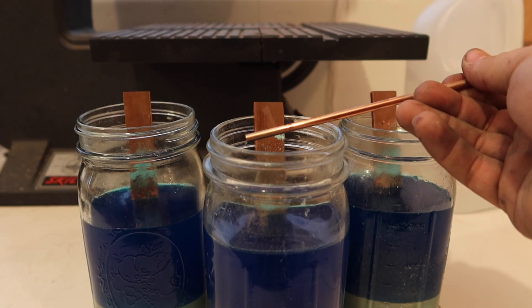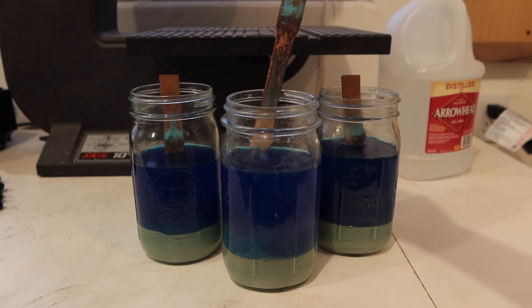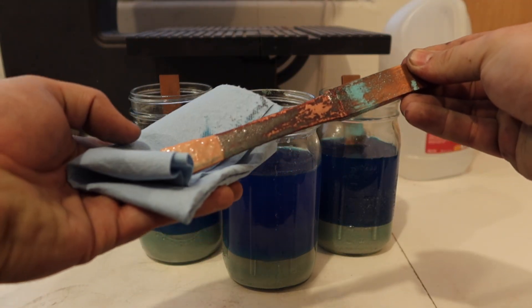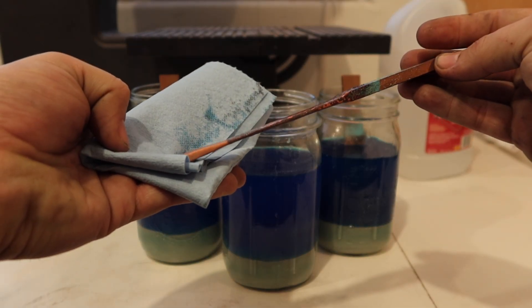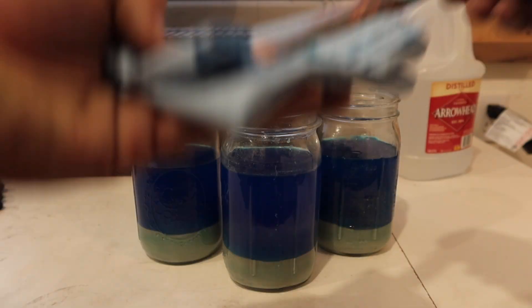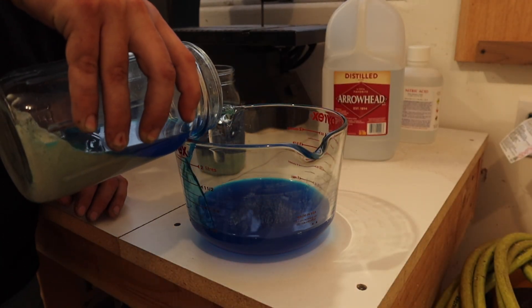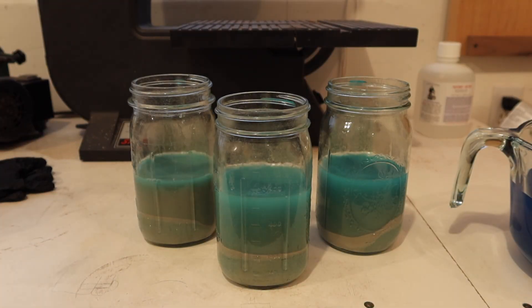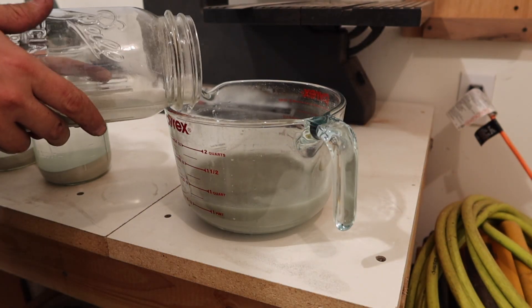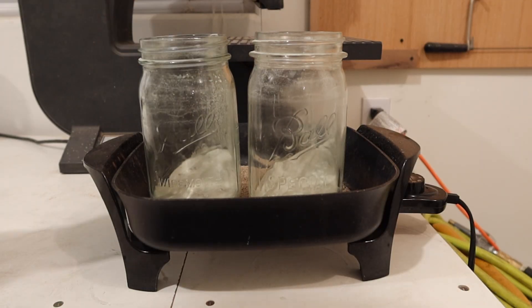All right, that looks pretty good to me. Now I can remove my bars from the jars. It's interesting to see just how much of the copper has been dissolved. To get rid of the copper nitrate I'm going to pour it off and wash it with distilled water until it's completely clean. Then I'm going to place the silver on my hot plate to drive off the rest of the moisture.